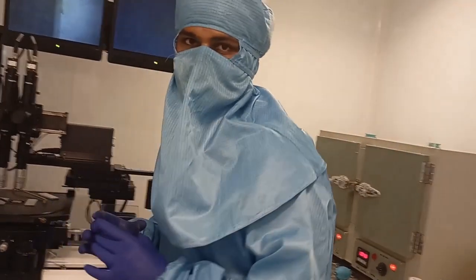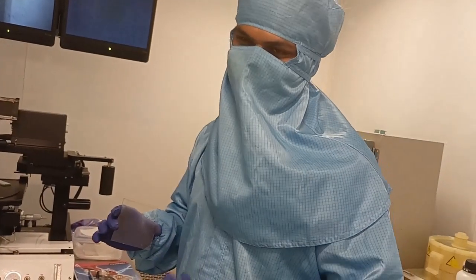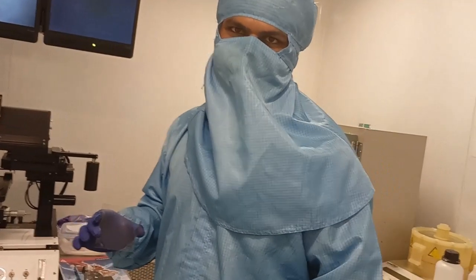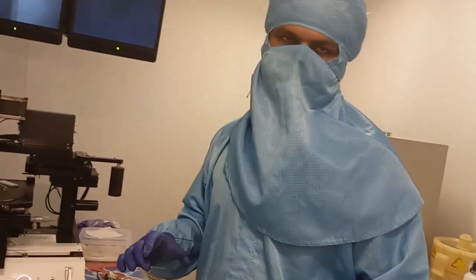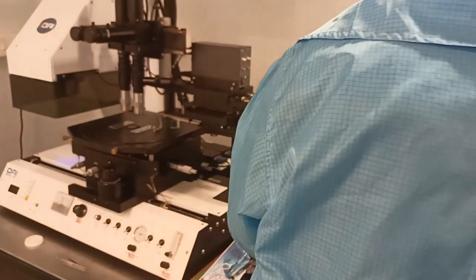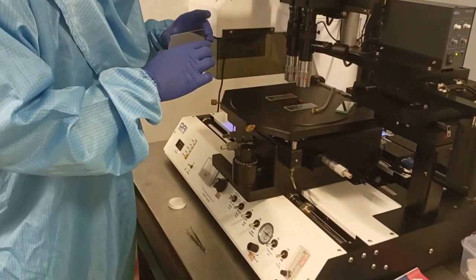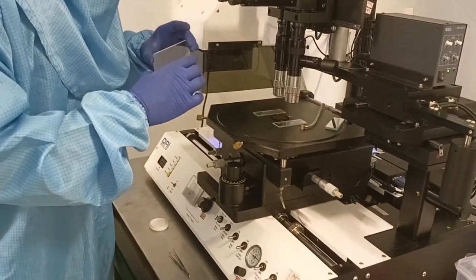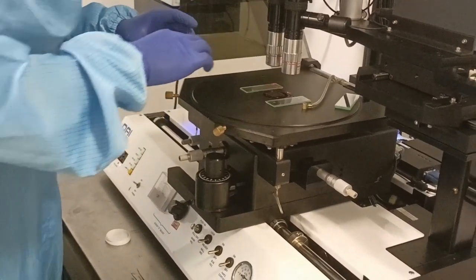What is the wavelength you are using? The wavelength we are using is 365 nanometers, and we always know that it is below the visible range. We are using high power, 365 nanometer. What we are seeing is the fluorescence coming from that material. Also keep in mind that this structure will be facing the photoresist coat, like that.